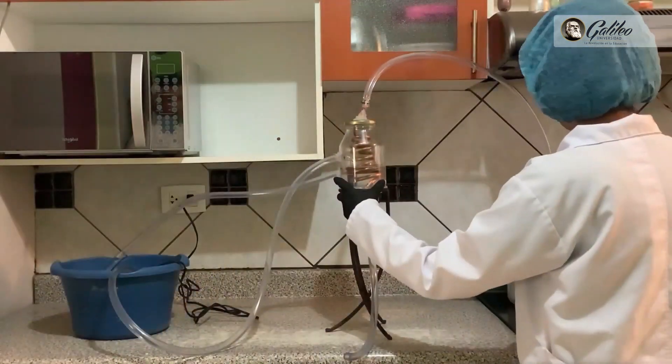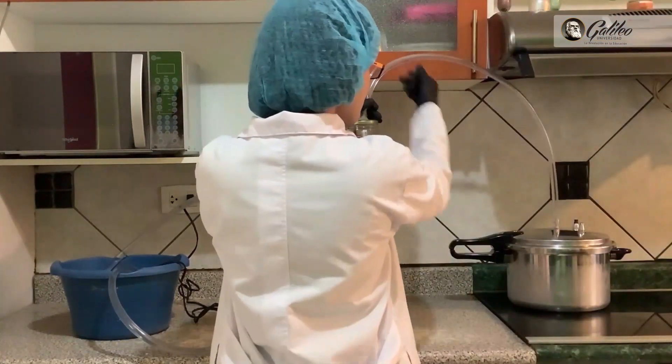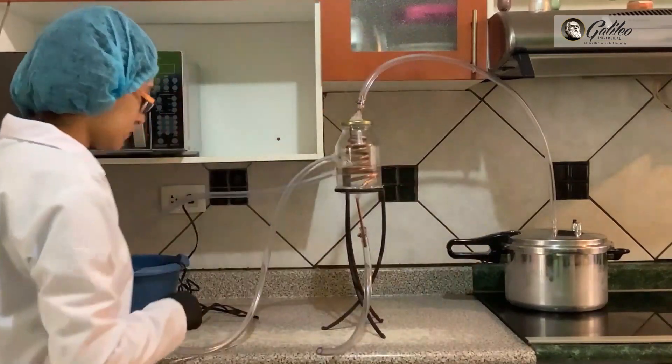This was a very beautiful and enriching experience, but at the same time quite challenging. In my case, I had issues with the condenser and spent a lot of time trying to find suitable materials to work correctly and carry out our practices properly. In the end, all the pieces fit together and worked perfectly, and presenting virtually was also a new kind of experience.